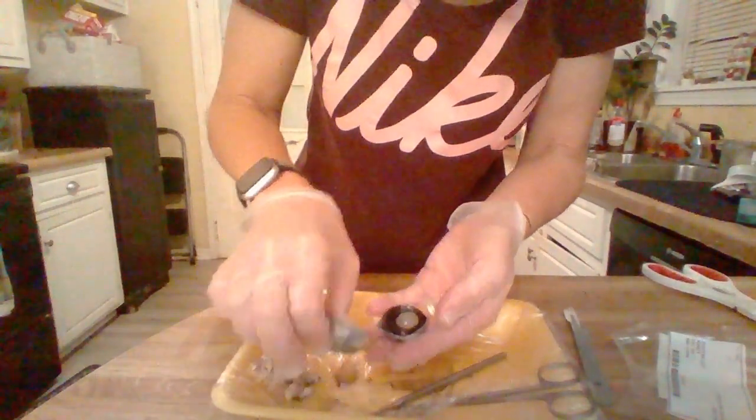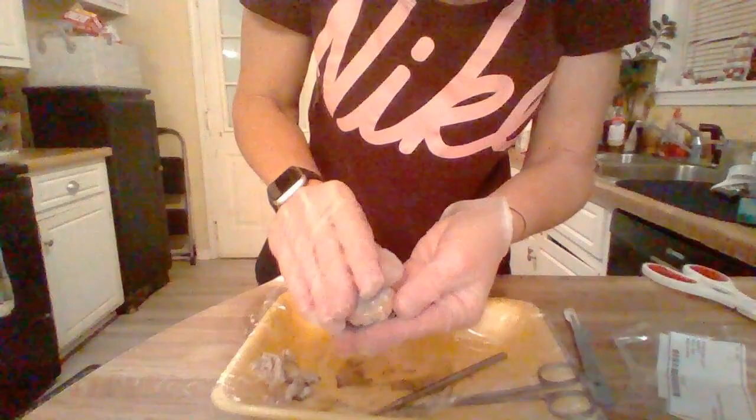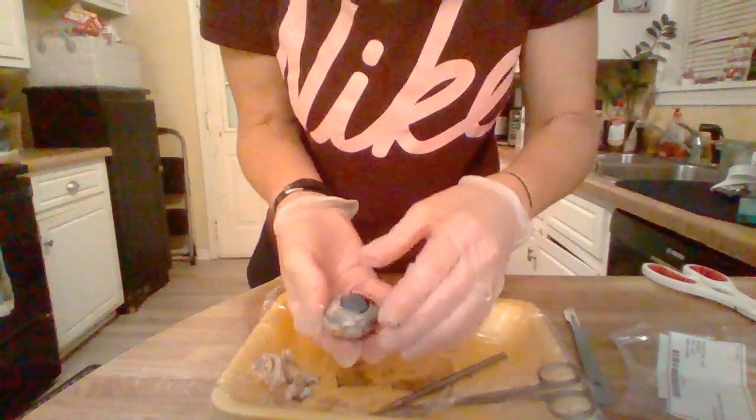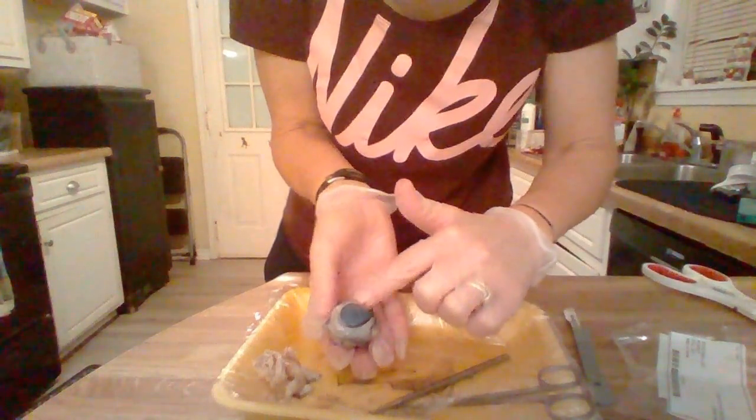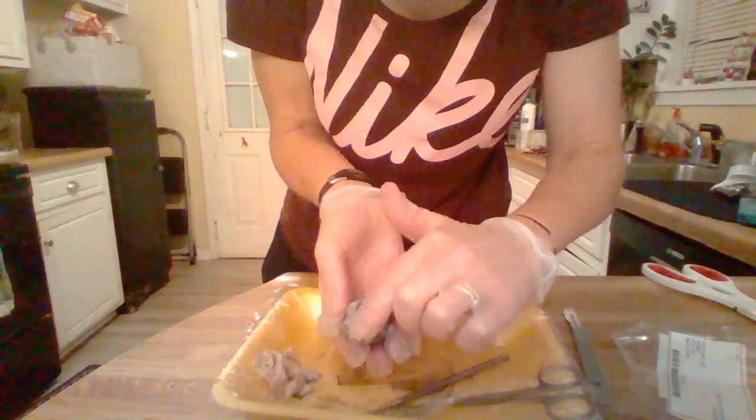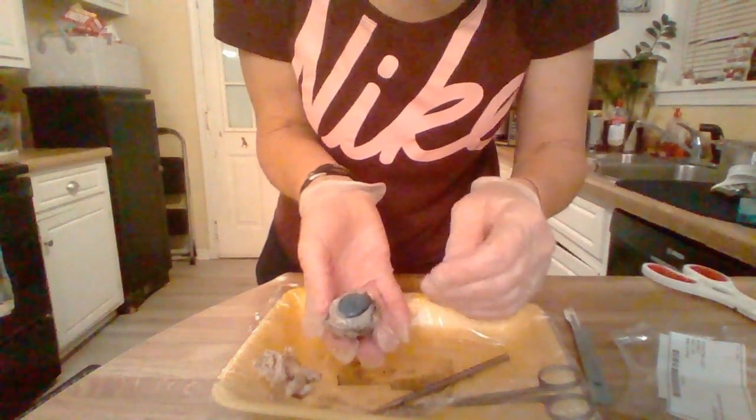Okay, so this was the eye. Here we have the cornea, and then the white part of the eye would be the sclera.